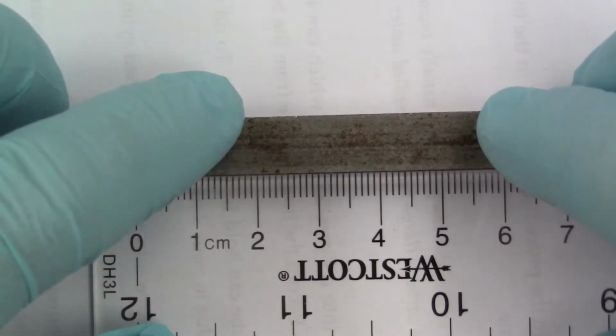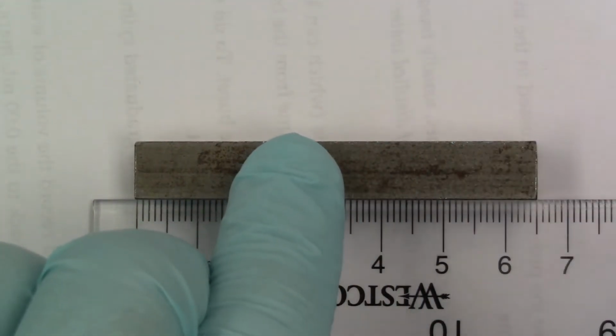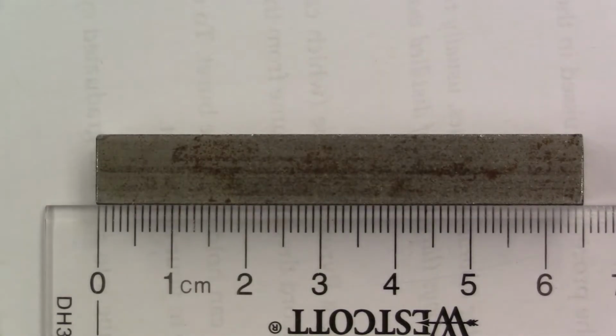So let's measure the length, shall we? There we go. And there you go. There's the measurement. Now remember, I'm not going to write these things down for you. You're going to have to read it off yourself. All the measurements in this class, the student must read. Let me see if I can zoom in for you on the measurement so you can get a little better view. There you go. So I think that's pretty easy to read right now. So write down that measurement. Don't forget the unit. Don't forget the estimated digit.